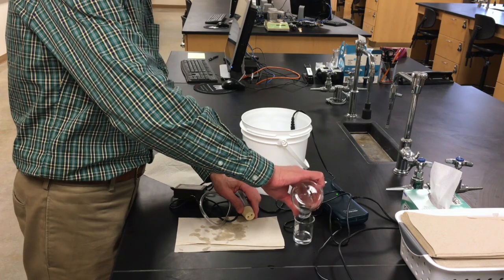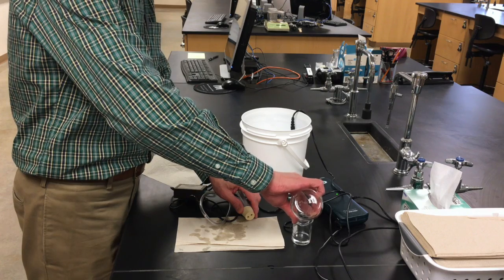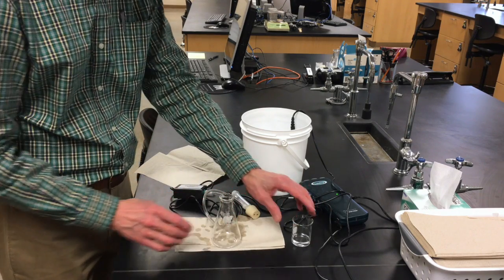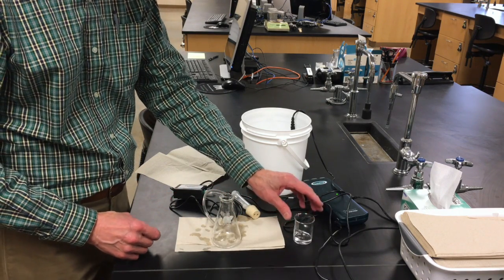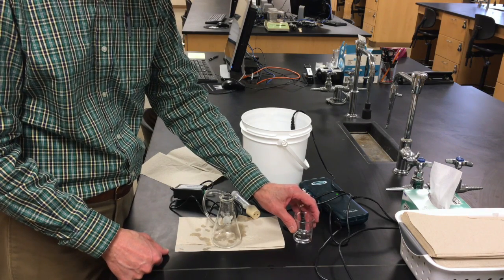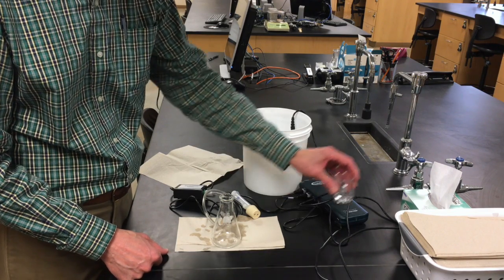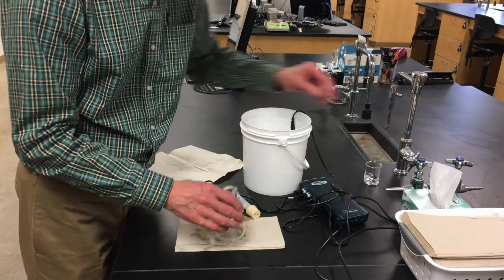There may be only 1.5 or 1 3/4 milliliters of ethanol left. We'll pour that back into that beaker, and this will eventually go to the fume hood and be put in the waste bucket in the fume hood that's labeled appropriately for that. I'll put that over there.